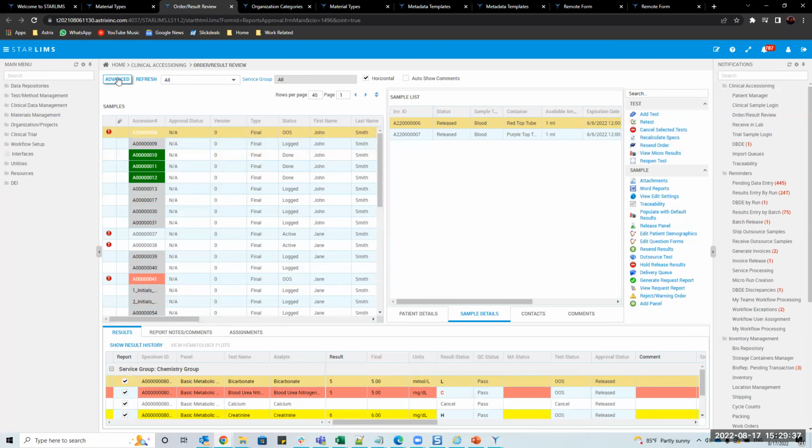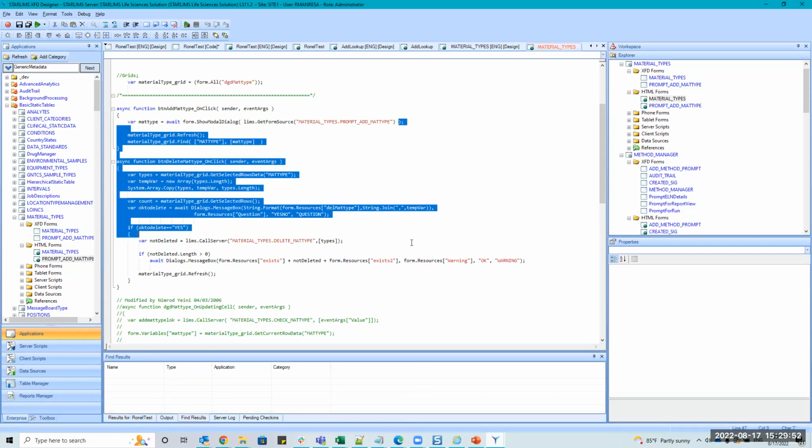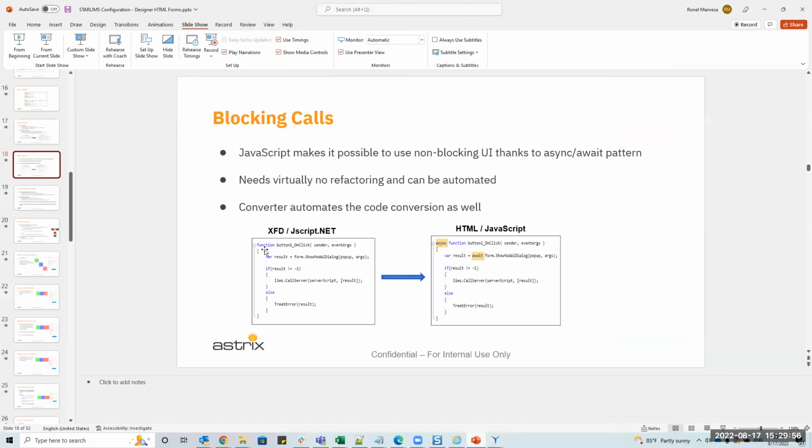So you can look at how that's done. Go into the designer, but basically, this didn't work, my search, but basically what's happening is they're not using an await, and then they're adding a callback to this function so that when the function returns, it executes something in that callback. And that's, again, a little bit more advanced, so I'm just going to move on. But for this slide here, this is what's to mimic the old. You just put async and await, and this is the pattern you see 90% of the time.